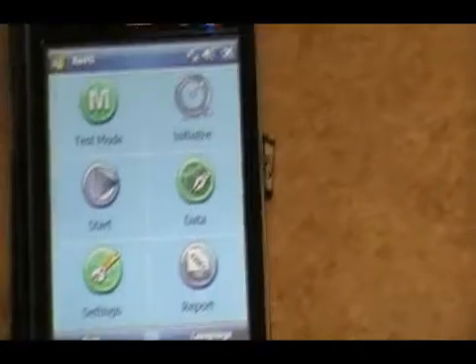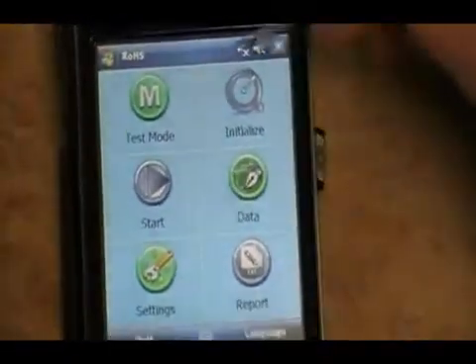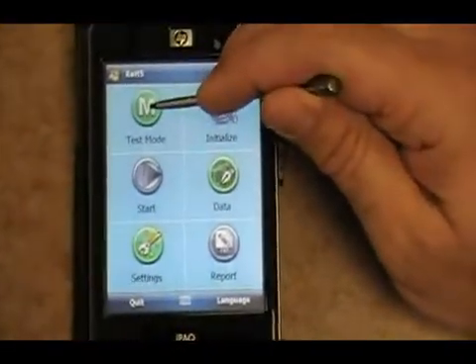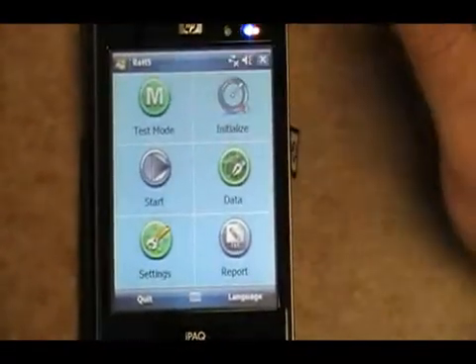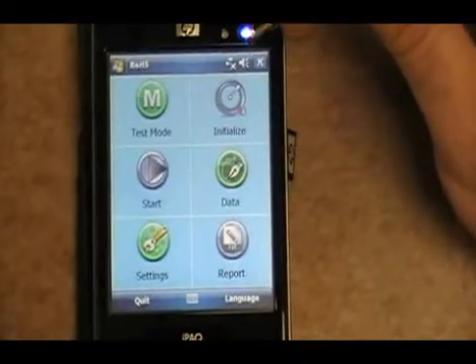I'll go over what those numbers are soon enough. Once you come into the ROHS program, you will then depress test mode, which is the first button on the main screen.